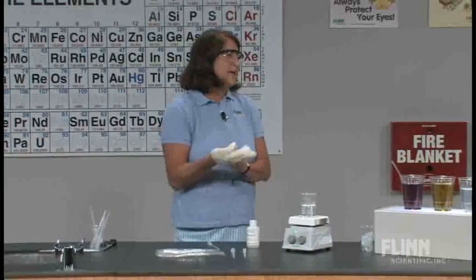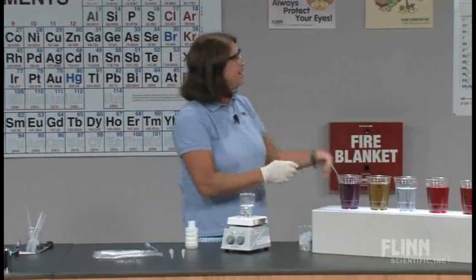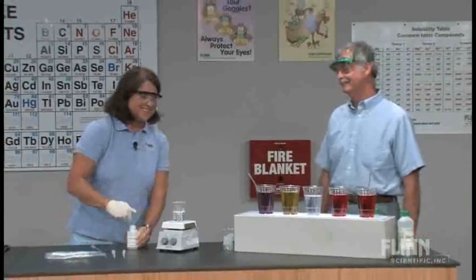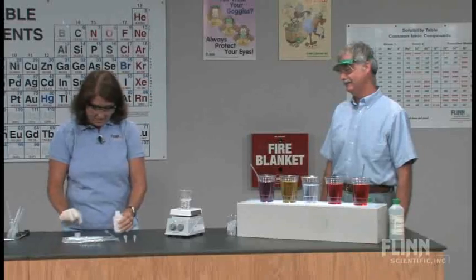And I'm going to ask my first victim — I mean volunteer — to come on up, Dave. I have a son who is David. I don't like him either. Teasing. I'm going to put just a little ammonium hydroxide into this pipette.